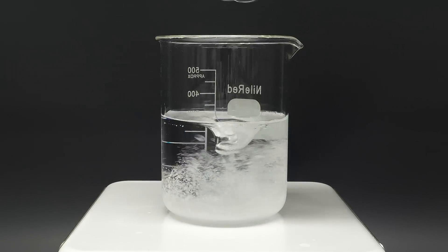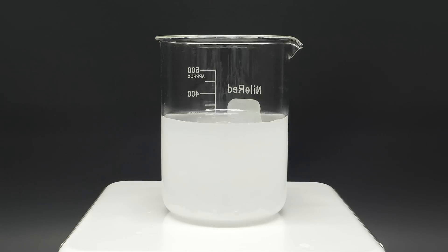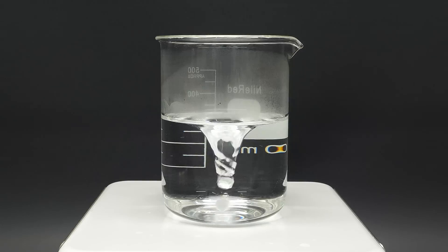Now, I can dump in some sodium hydroxide drain cleaner, and I have to wait for it all to dissolve. When I didn't see any left, I turned on the hot plate, and I waited for it to heat up.